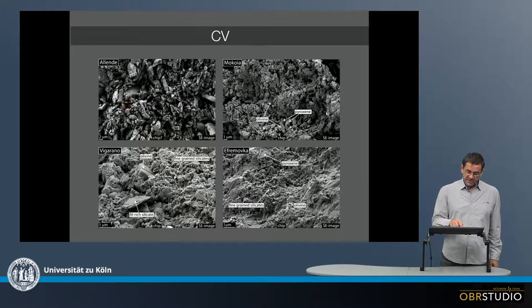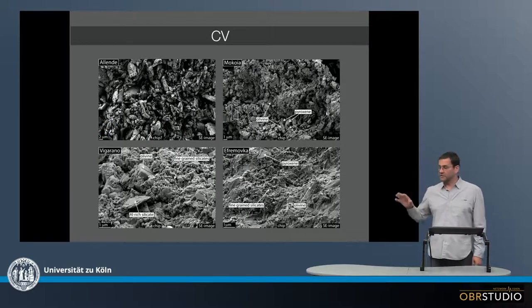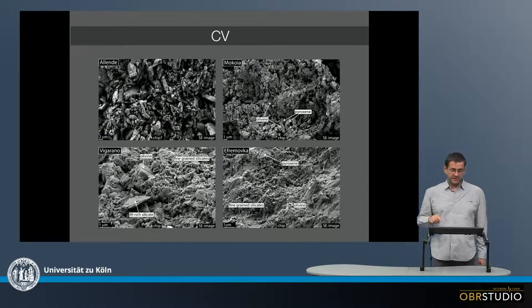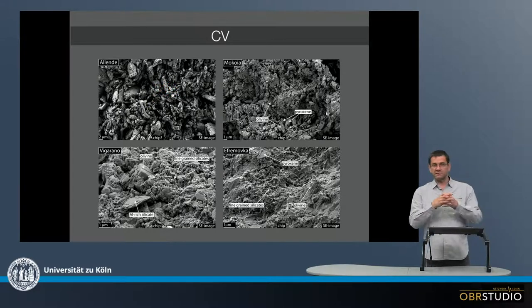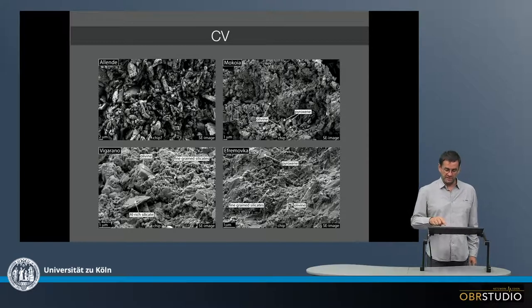And this conglomerate structure here in Allende can be seen in this really nice image here, so this is two microns, and we again see down to submicron structures here, and we can really see the individual grains that are all just mingled together into this conglomerate of what the matrix is.